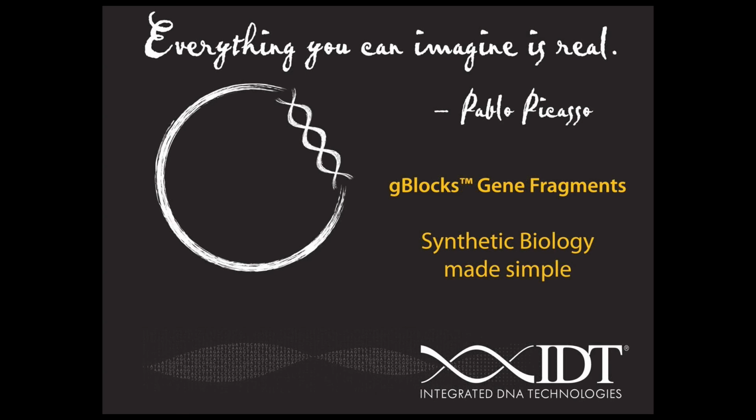Okay. There are a couple of questions here about restrictions with manufacture of gBlocks. So one person, more of a comment, said that there seemed to be a lot of restrictions for gBlock synthesis, and then another person was asking if we had made any progress with making gBlocks fragments that are higher in GC content, and it would be helpful to know when was the last time they attempted to order, since some things I know have changed.